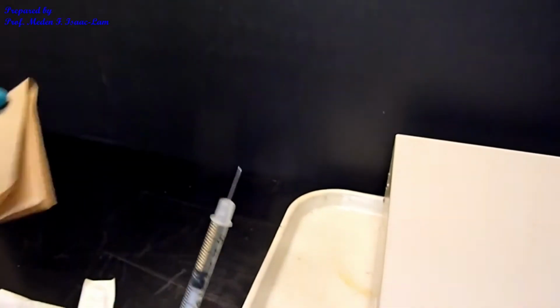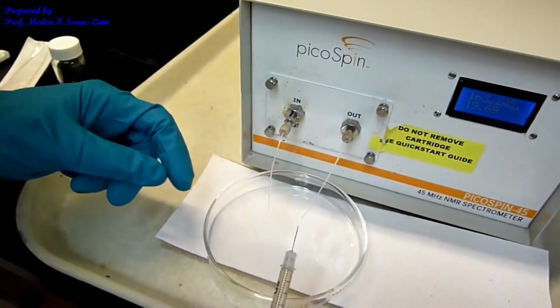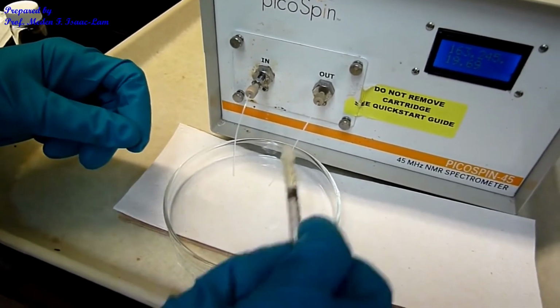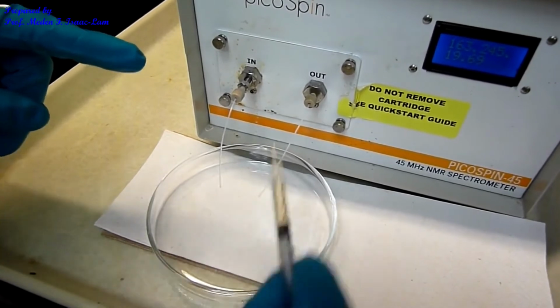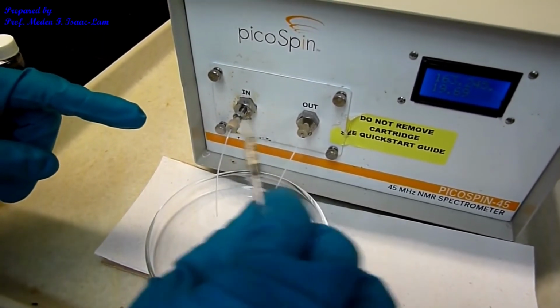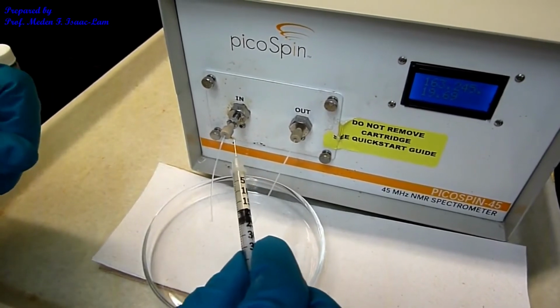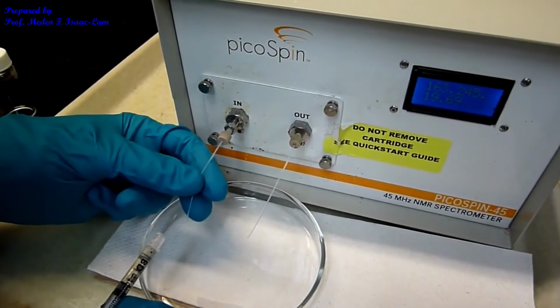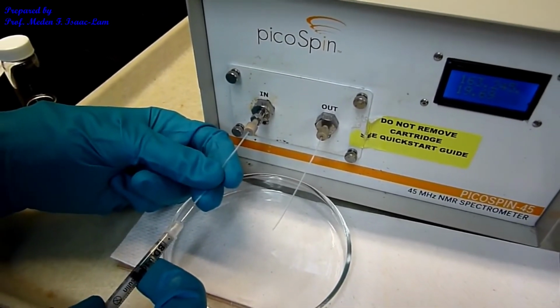Okay, and now I'm going to inject into the inlet port, and this is the outlet port. So we wanted to get like 8 drops out of the outlet port, so that I push the sample out of the instrument. So there's a loop inside the magnet, and it accommodates about 20 microliters. So now I'm going to gently inject it into the inlet port.